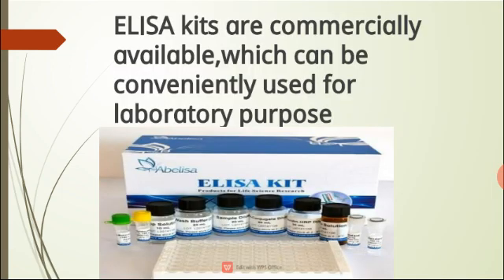ELISA kits are commercially available and can be conveniently used for laboratory purposes. Here you can see the picture of an ELISA kit with a microtiter plate and buffer solution. The microtiter plate has 96 wells, so you can easily read 96 loaded samples with their controls.